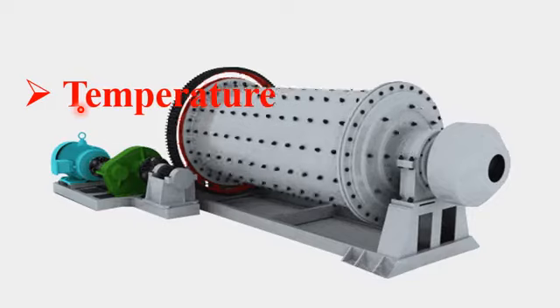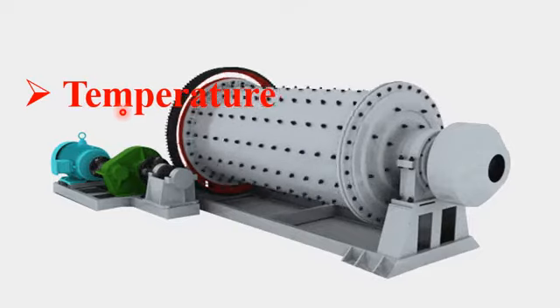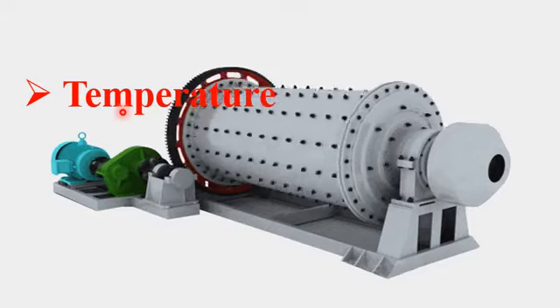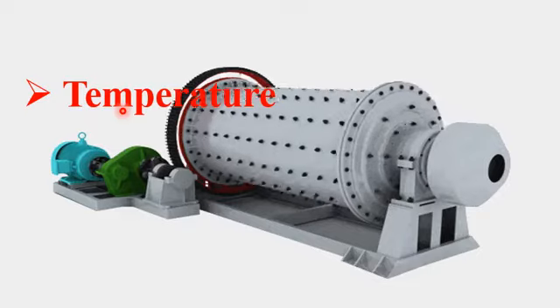We also need to consider what kind of bulk material we use, whether this bulk material is previously sintered or annealed, or do we need to anneal the bulk material after doing ball milling, after getting a ball milled material.